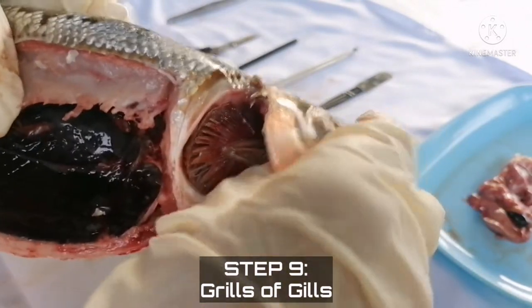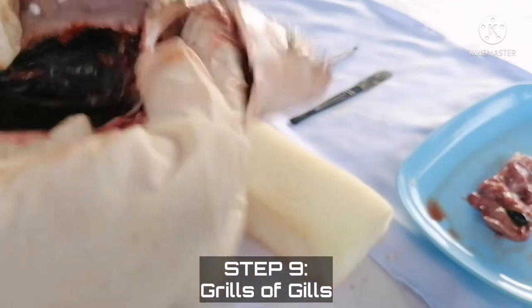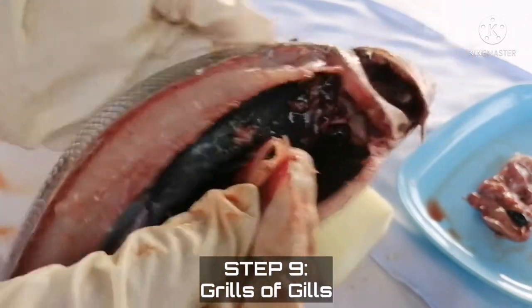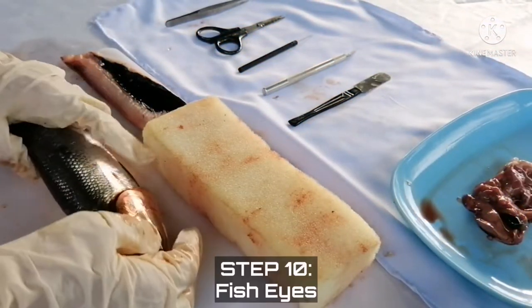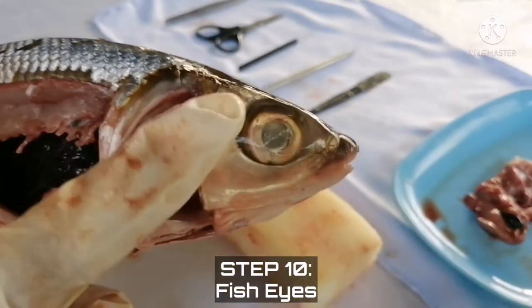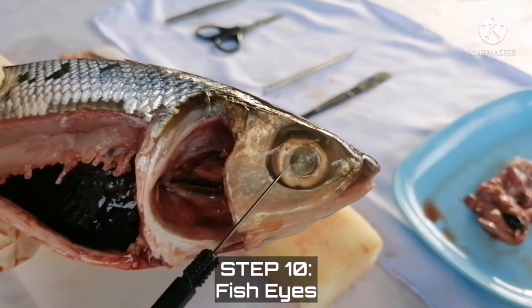So now, we need to remove the gills of the milkfish. As mentioned earlier, they have a total of 8 gills, 4 on each side of the mouth cavity. The last and the final step in dissecting the milkfish is to remove the eyes that includes the pupil and the lens.